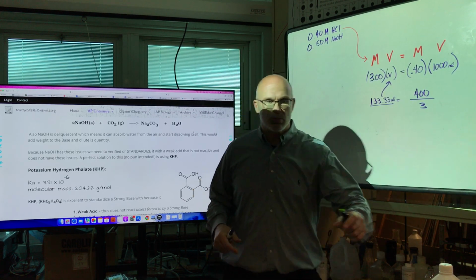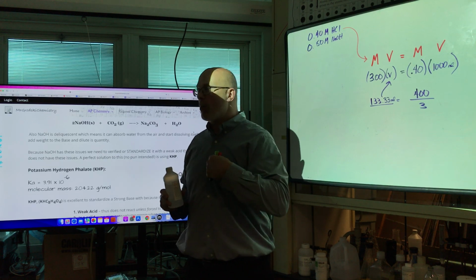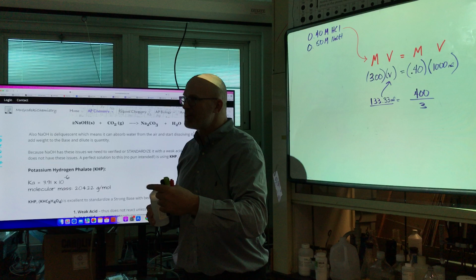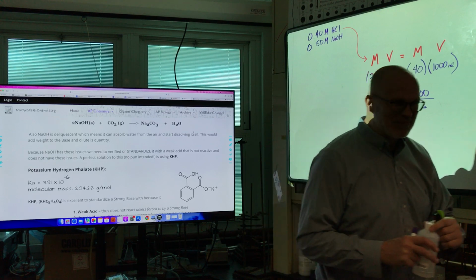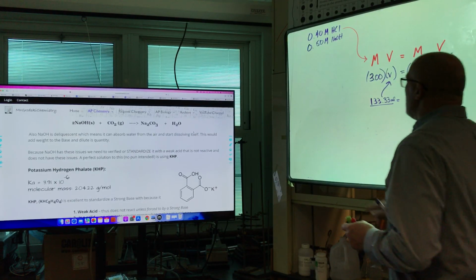The problem is students will do it and leave the top off. And as I'm walking around, I won't be walking around. Lab assistant Ben will find tops off and he'll be screaming at you. He's not really good with kids, okay? All right, put the tops back on. Any case, so that is that.